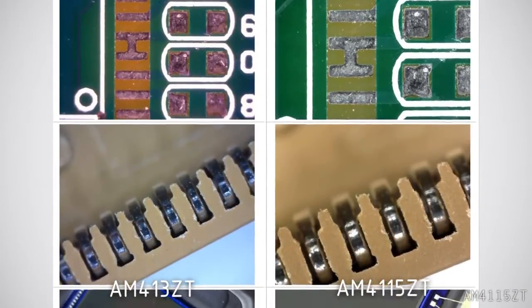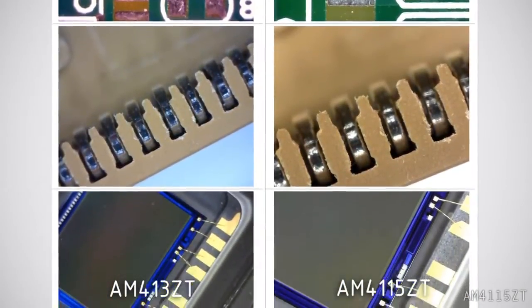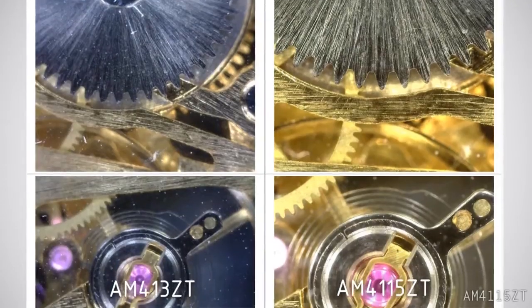This is a comparison of the AM413ZT and the AM4115ZT.